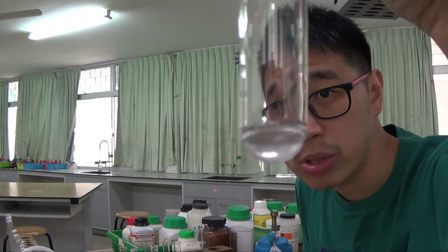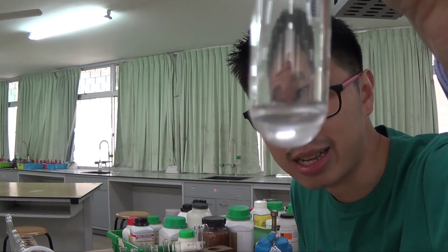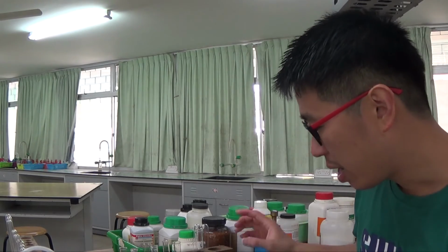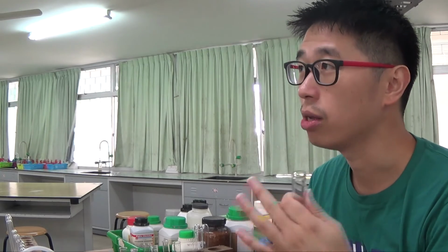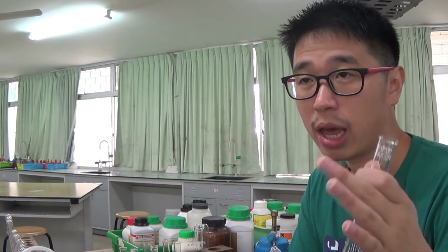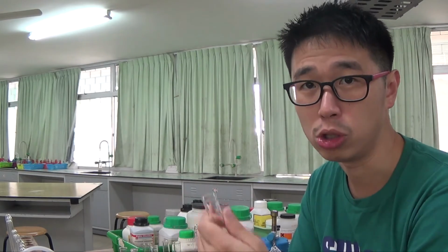Okay, so suppose I have this mixture, which is reasonably clear to start with. When I add sodium hydroxide, I have aluminium 3+, remember? I also have ammonium ion NH4+. NH4+ with sodium hydroxide on its own will not do anything until I heat it. Then I will get ammonia gas, which is the test for ammonium ion.